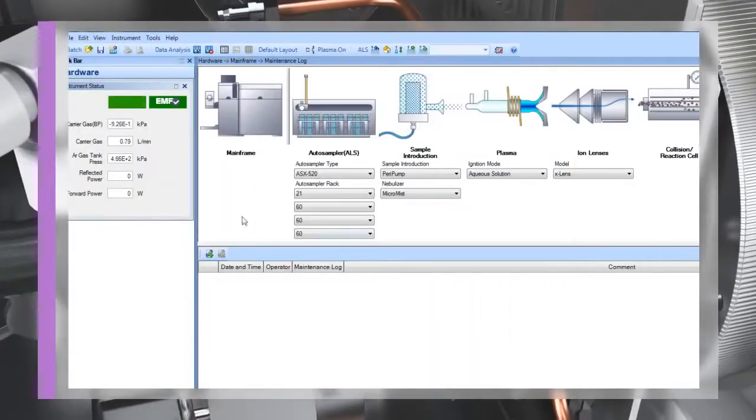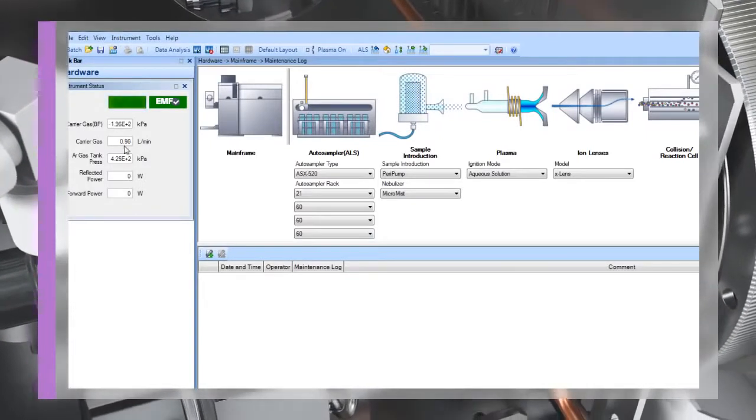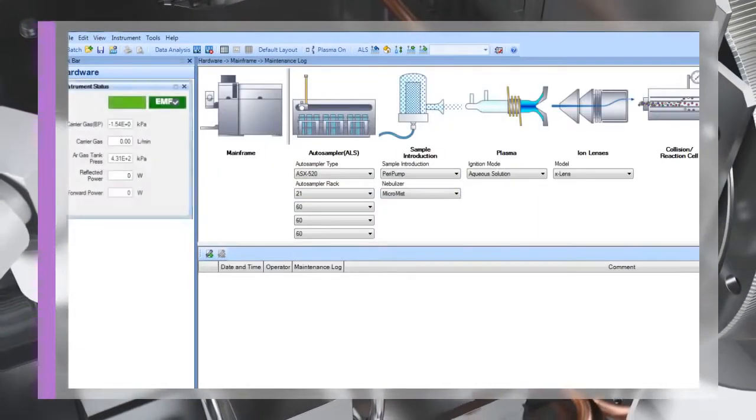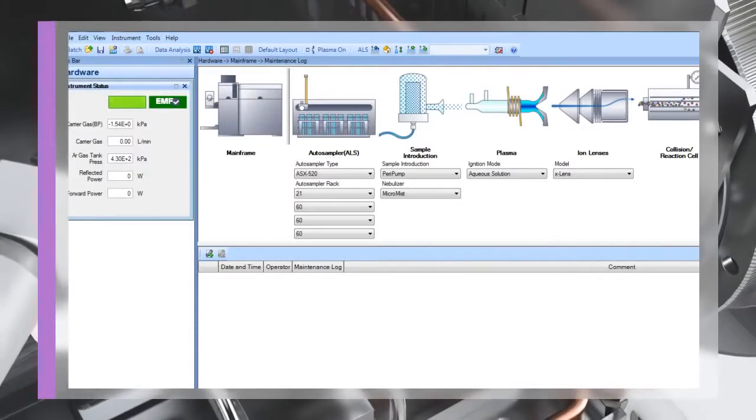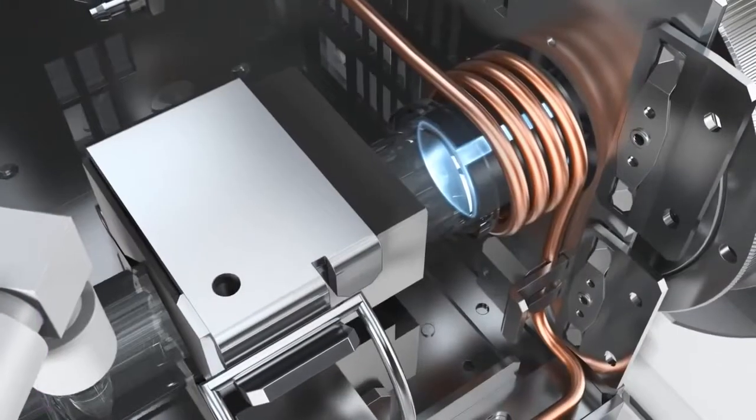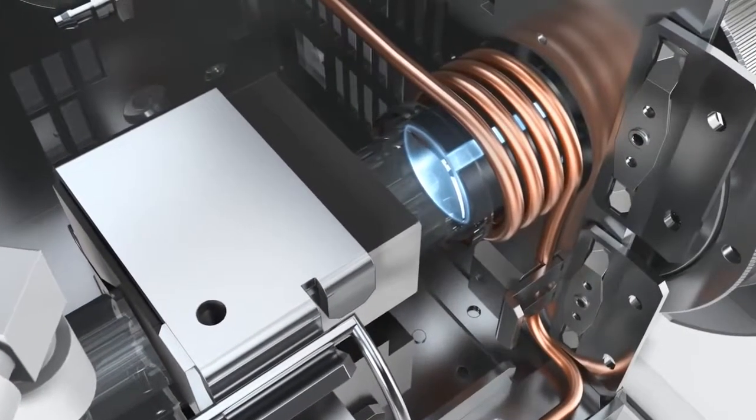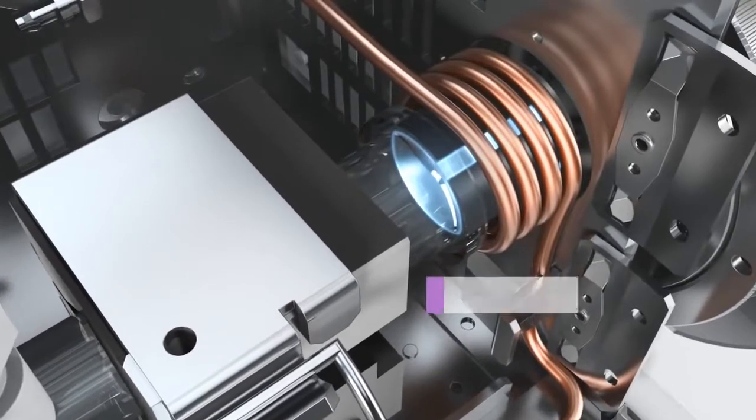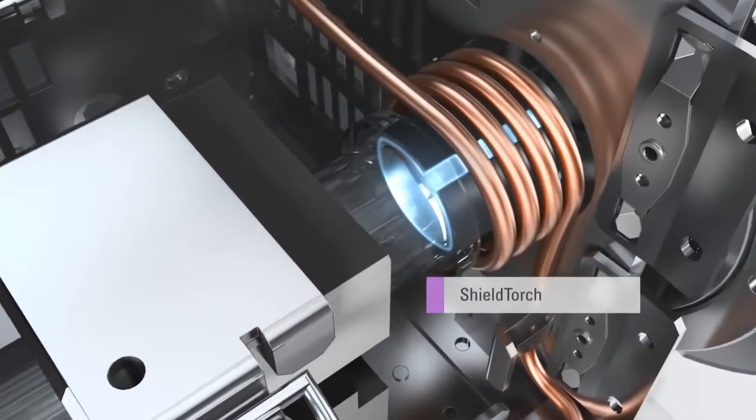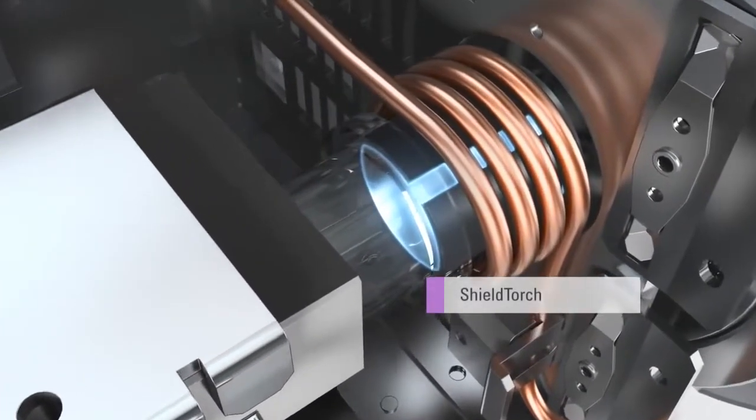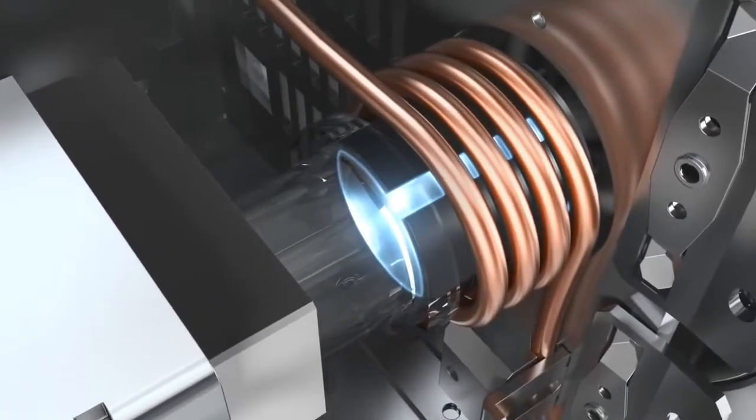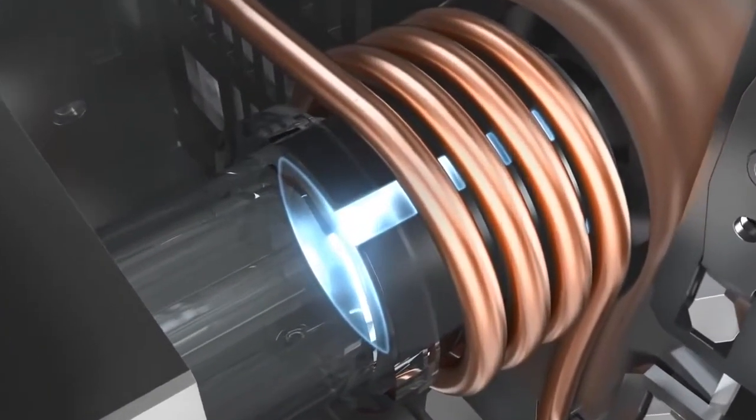The torch position optimization is automated as part of the MassHunter software startup sequence, ensuring consistent operation from day to day. All 7700 series instruments are fitted with Agilent's shield torch system, which ensures that ions enter the vacuum system with a narrow energy distribution. This is essential for the most efficient interference removal in the collision reaction cell.